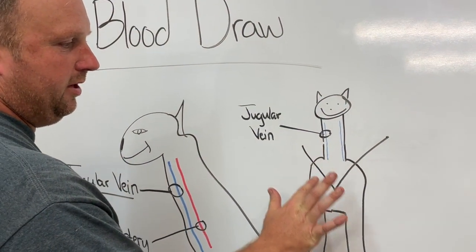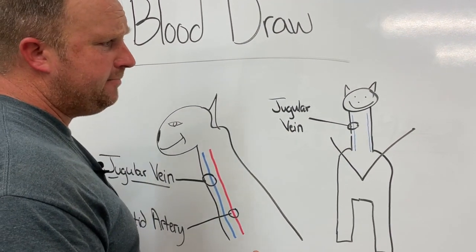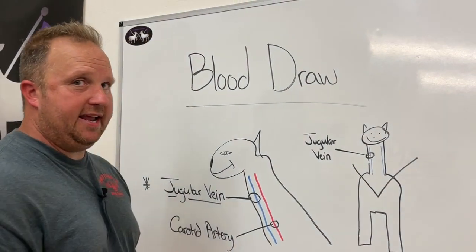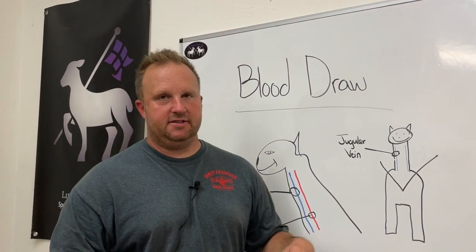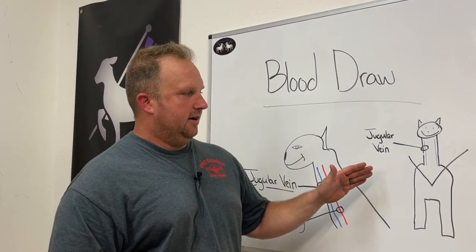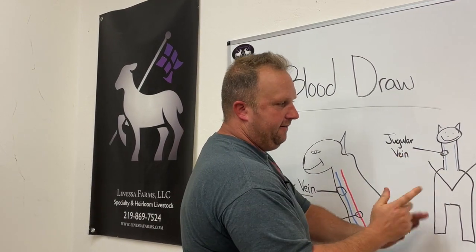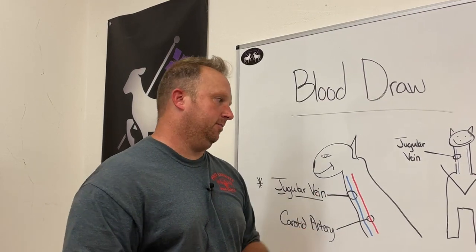If you look at our sheep and goat from the front, you can see that you're going to have a jugular vein running on both sides of the neck. We're going to apply pressure with our hand where this V is, so you'll see me applying pressure to get that vein to pop out a little bit. If you're right-handed, you're going to want to stand on the right side of the sheep — that is, the animal's right side, not facing the sheep. If you're left-handed, obviously you're going to be on the left side so you can utilize that hand to draw the blood.